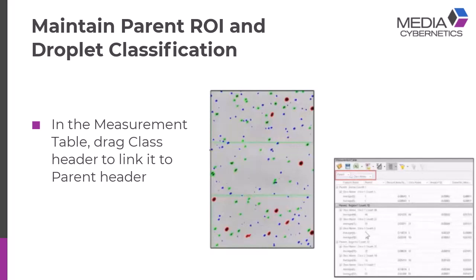The key is, once I've now classified it, there's one last part. In this header part, in the measurement table, I need to take the class name and bring that over under the parent. If you've never done this, the data tables, measurement tables in ImagePro, you can configure them in a number of ways to really tailor your data output for what the research needs are. And this is just an example. You can actually drag these and do further classification.